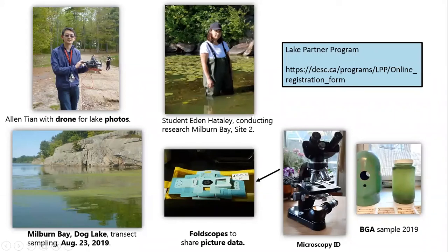Welcome to the foldscope portion of the workshop. Alan Tian and Eden Hatley have shared a lot of interesting data and insights into blue-green algae blooms. The foldscopes are one more tool to use in our understanding, along with data collected from the Lake Partners program and through studies such as we've seen from Eden and Alan.